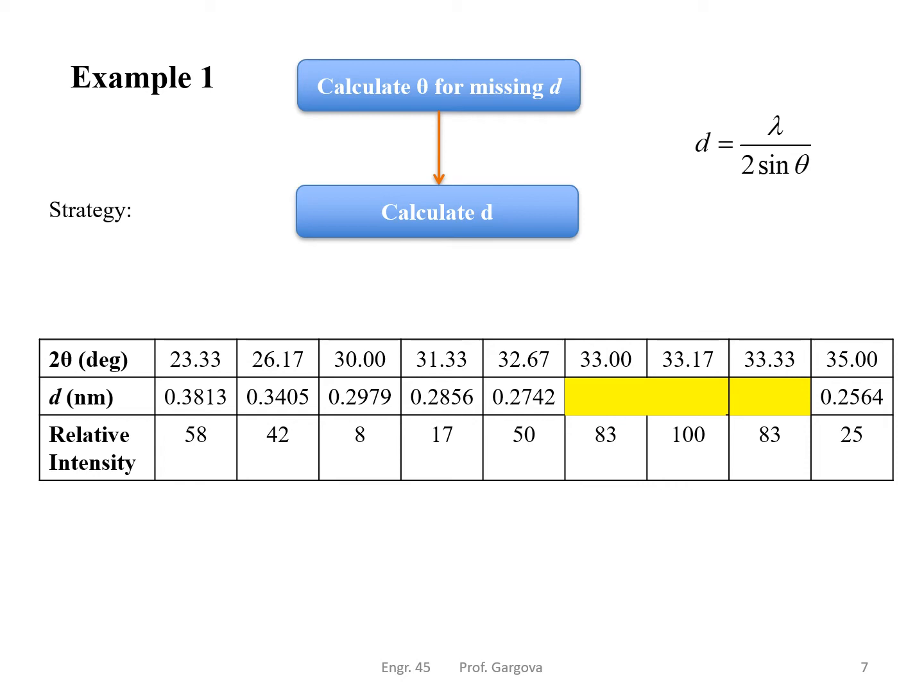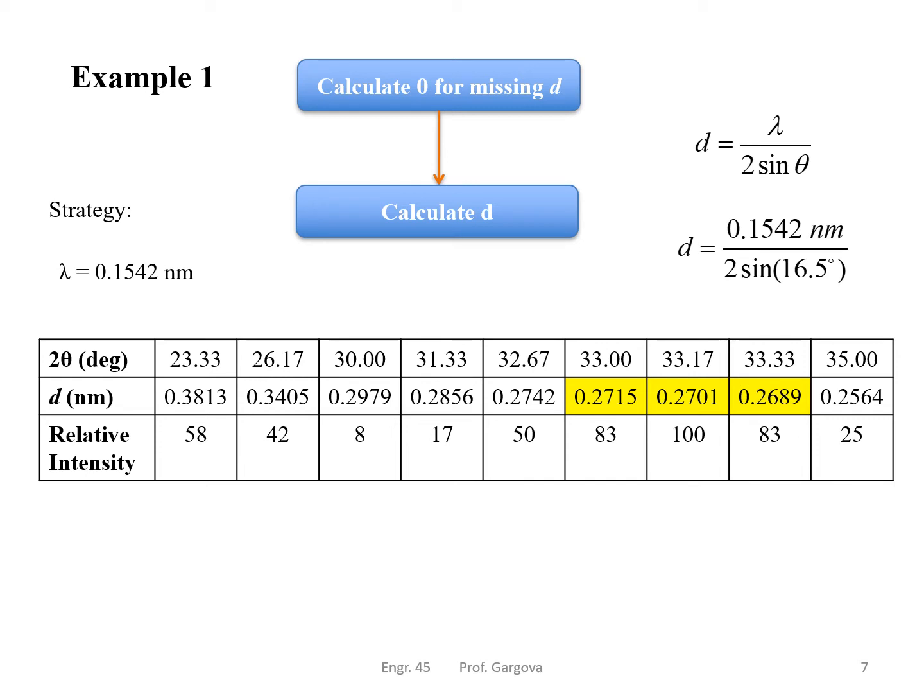So we basically use this 2 theta and divide it by 2 to then plug in here as a theta. And with that, we should be able to find the D spacing, which is found the following. Comparing to our answers, we see that as we are increasing the 2 theta, it corresponds to a smaller D spacing, and that follows the trend here.